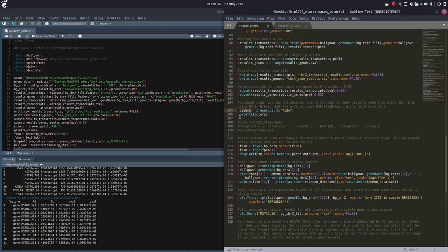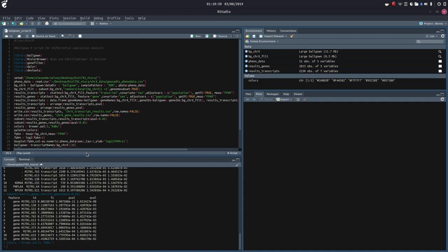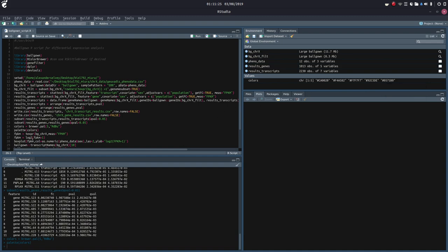I set that to the colors variable, and then I used the palette command and inserted my variable colors. Let's run this — it populates here. These are the actual color codes. They don't use blue, green, yellow — they use numerical and alphabetical characters to designate the different colors. Then we've initialized our palette using our colors variable. I've also included the RSkittleBrewer code down here if you'd like to use that.